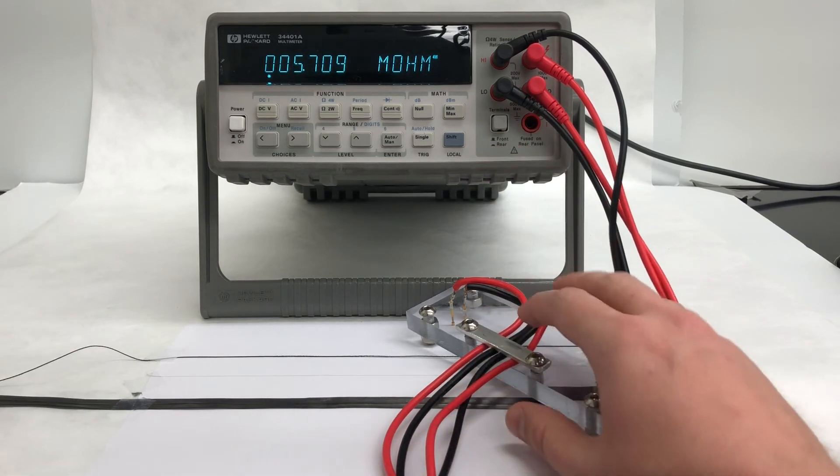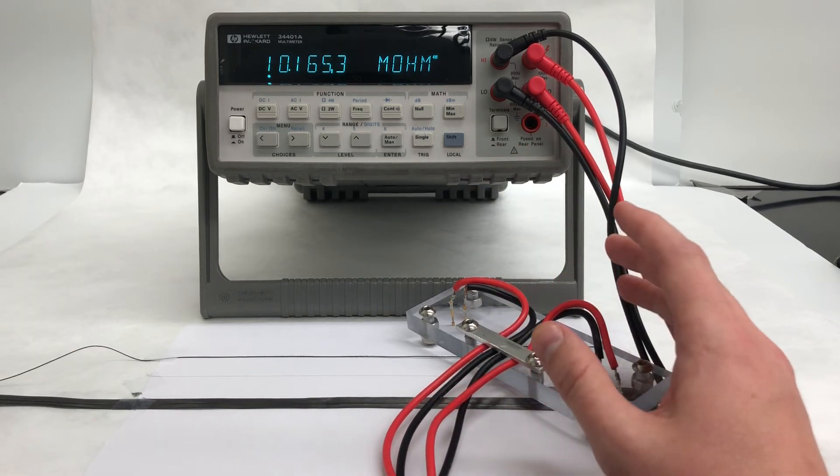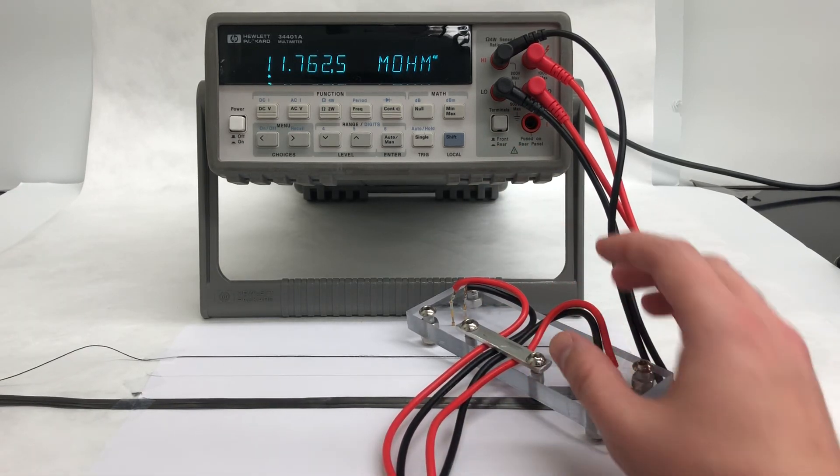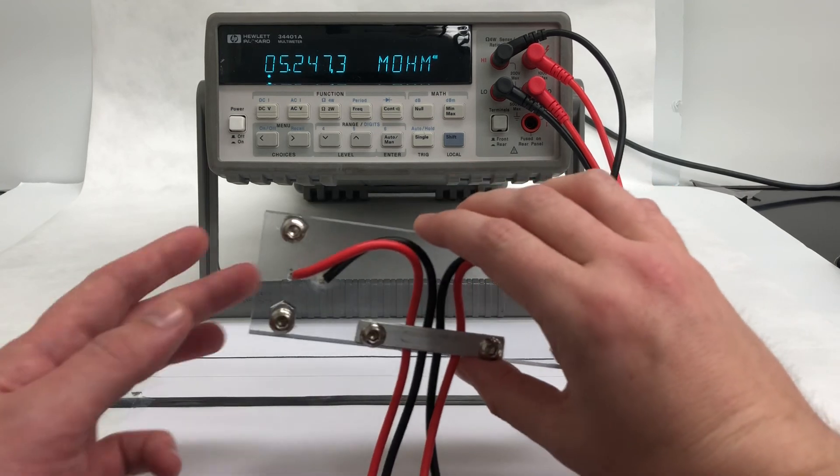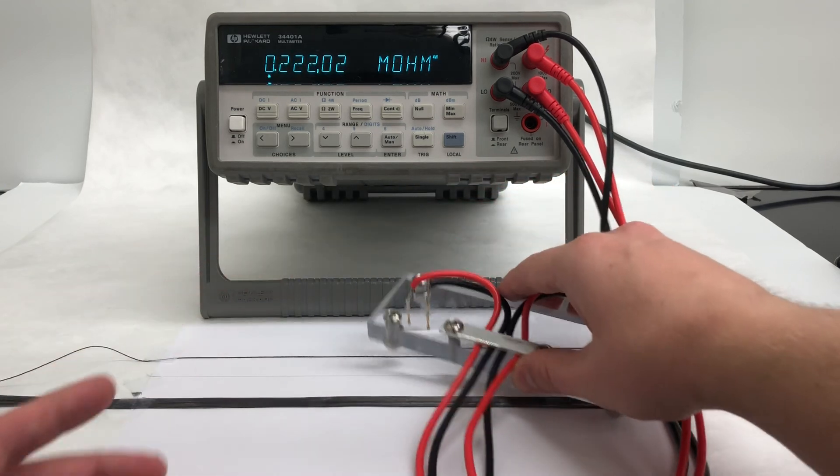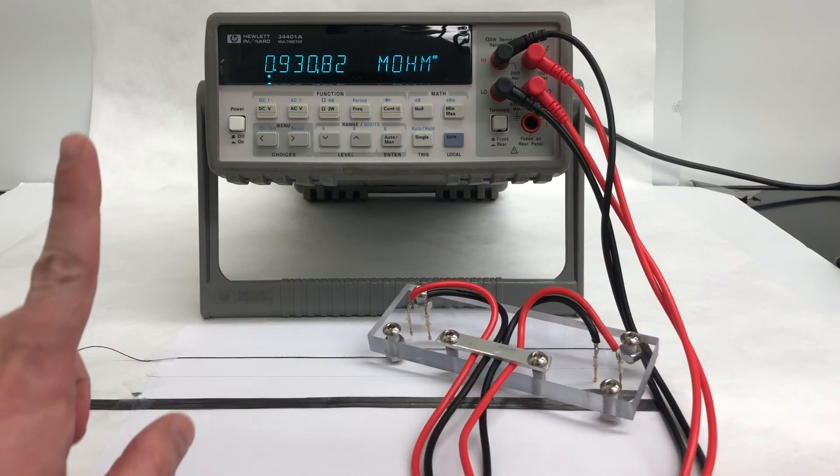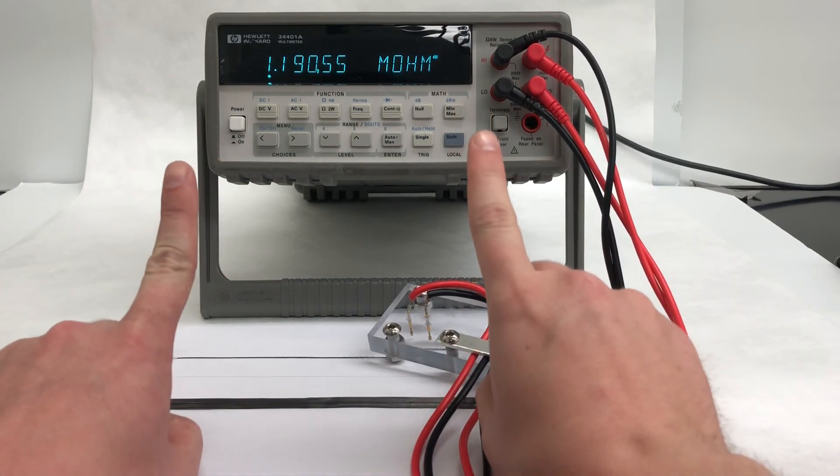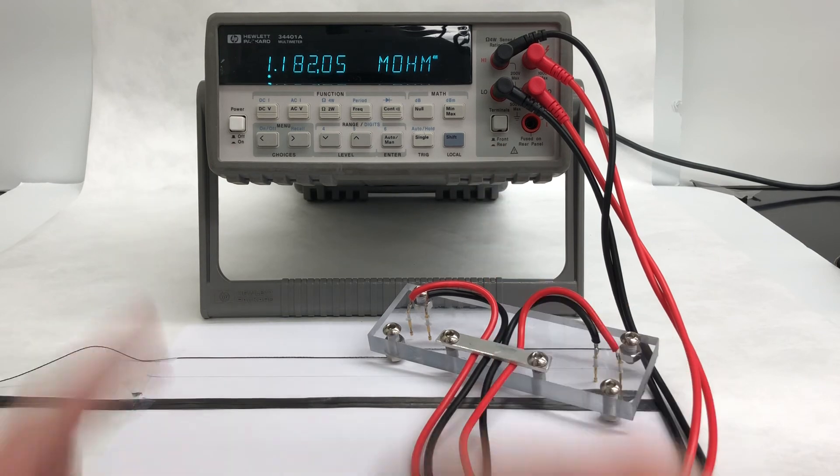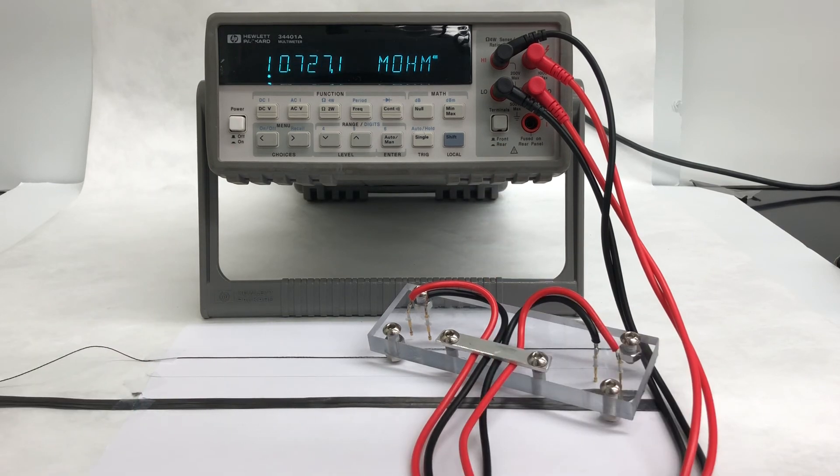So, to measure the resistance of samples like that, we'll go to a different tool that, instead of having a point contact, contacts the tape with a line of electrical contact across the width of the tape.